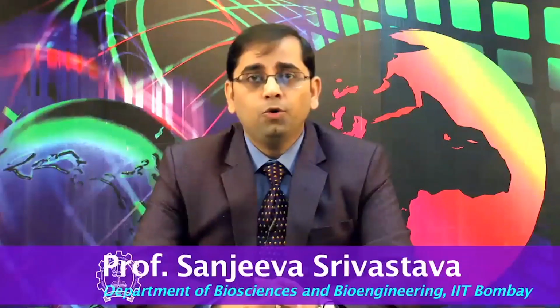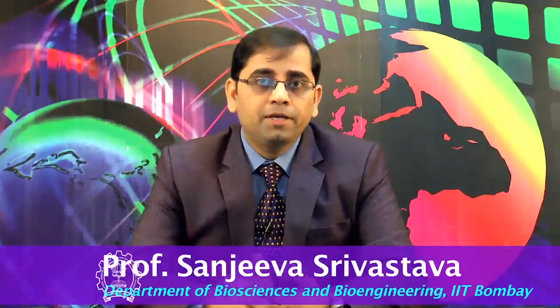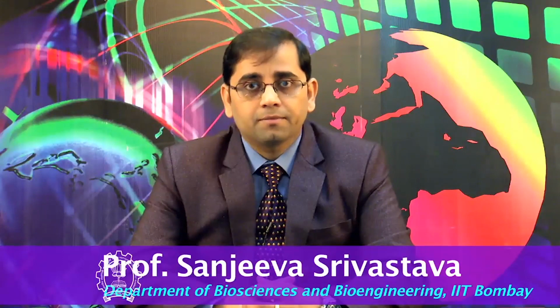We are discussing different microarray based platforms and how to perform some biological applications on these chips. In the last lecture, Ms. Apurva Venkatesh showed you how to perform a microarray experiment using serum samples obtained from patients who are suffering from falciparum or vivax malaria.